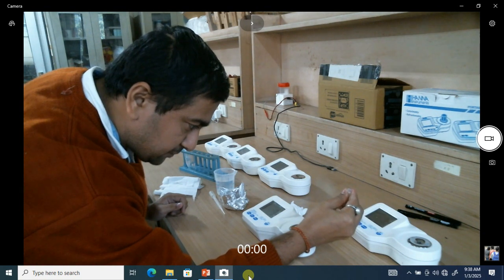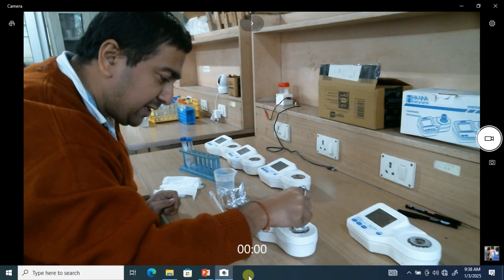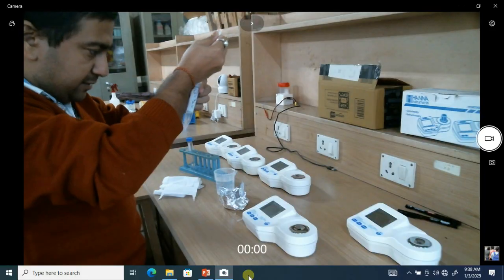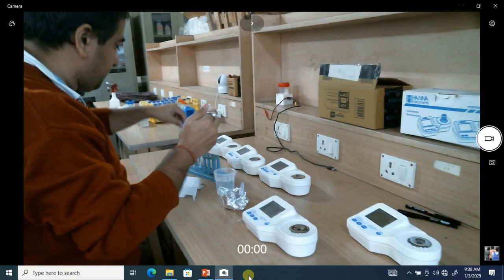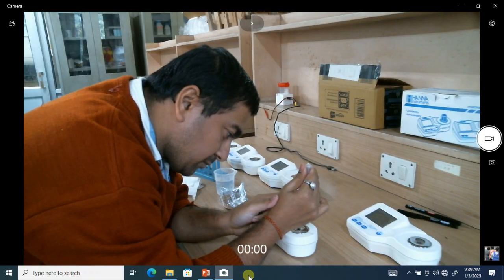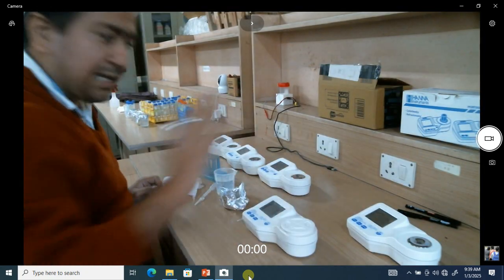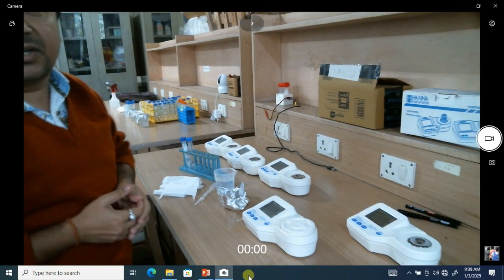Again, we will remove the water with the help of a dropper. Now we will wipe it off gently and very softly, not touching it with your fingers. Again, we will take the same solution that we want to measure. Now, we will close the cap and go for read. The same procedure. It's 1.3343. So we have got both ND and ND20.